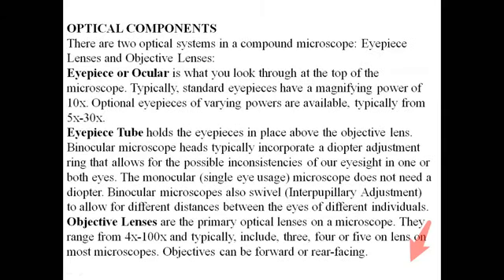They range from 4x to 100x and typically include 3, 4 or 5 lenses depending on the type of the microscope that we are using.